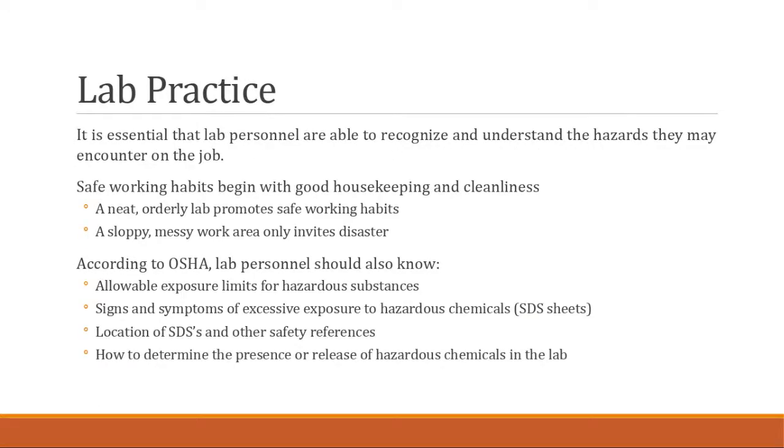Looking at lab practices, safe work habits, housekeeping and cleanliness. If you keep it neat, it's going to be easy to work in. You can promote yourself some safe working habits. If it's sloppy, that's going to be a big disaster. So, like I said, a lot of this stuff is chemical based. You'll get a lot of the touch on this when EH&S goes through their lab safety training.